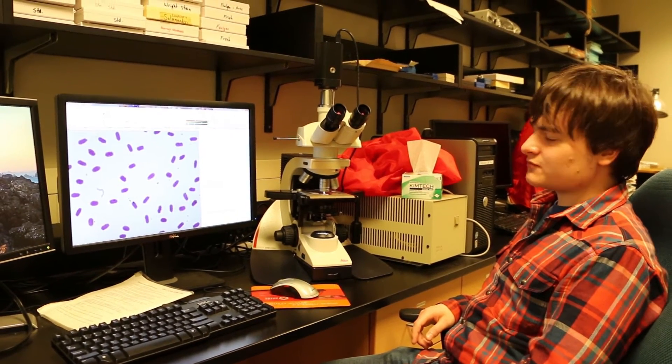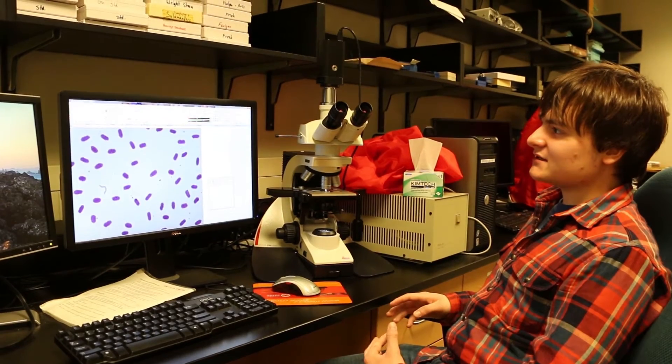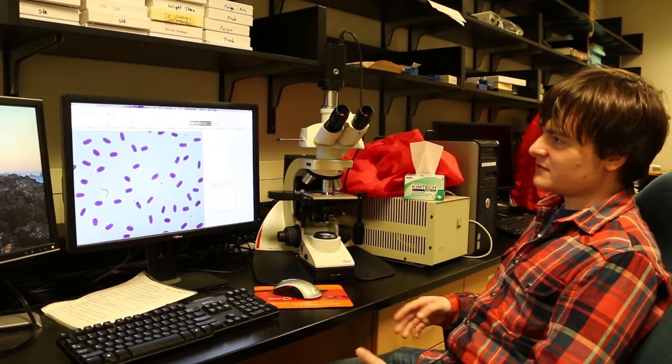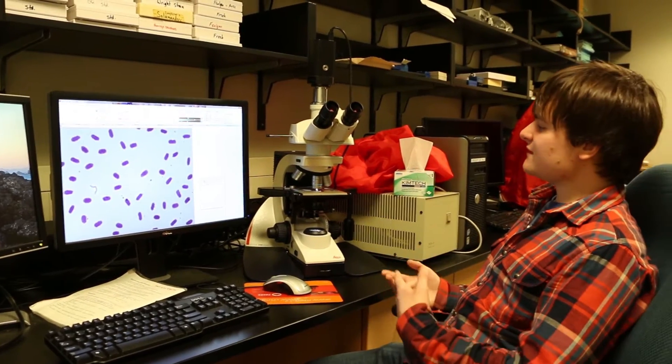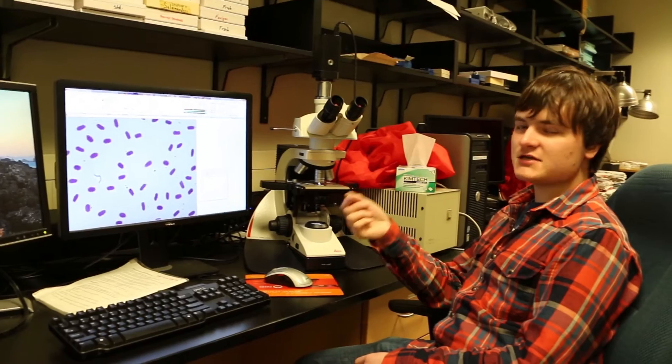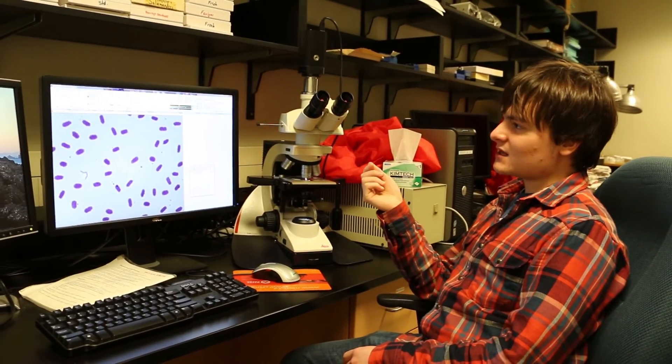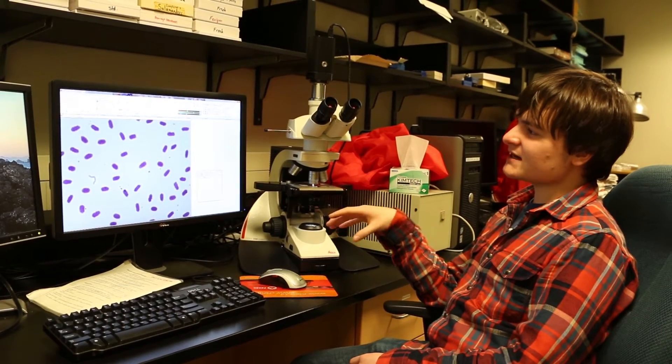And the way this actual process of analyzing genome size works is it uses a technique called Feulgen image analysis densitometry. So you stain the blood on the microscope slide using Schiff reagent, which is a stain, and that stain stains the DNA on the slide selectively.